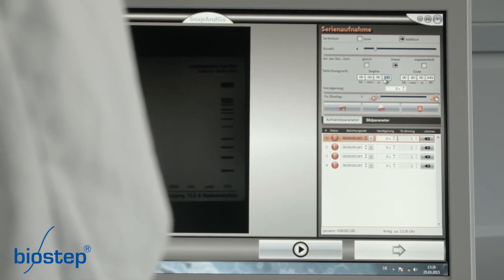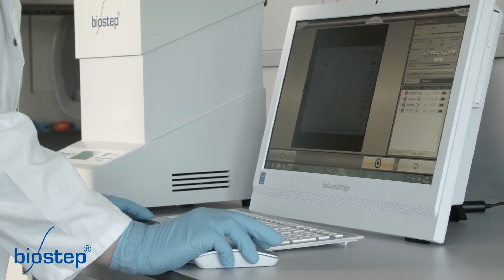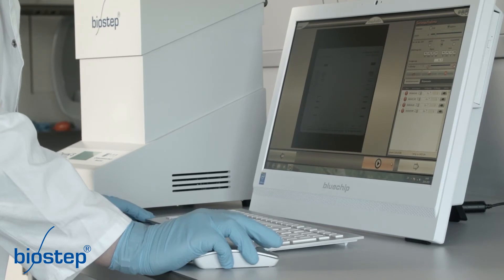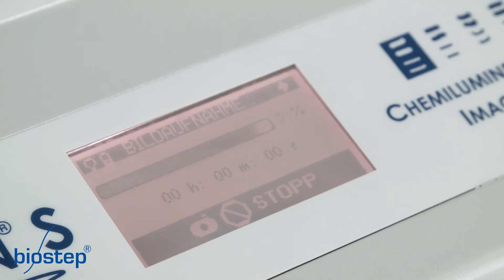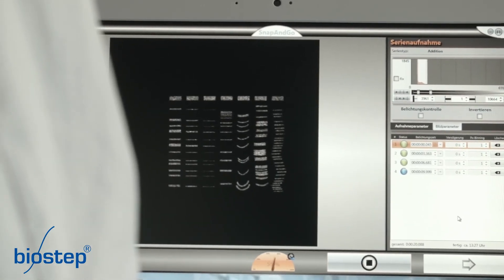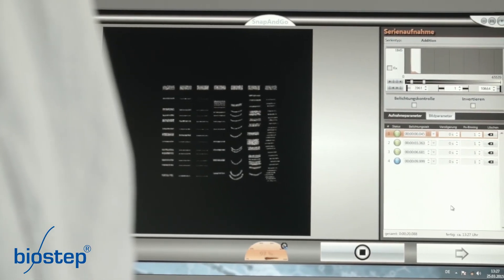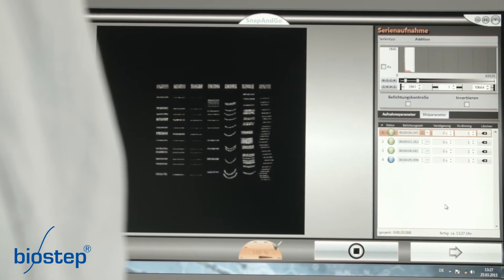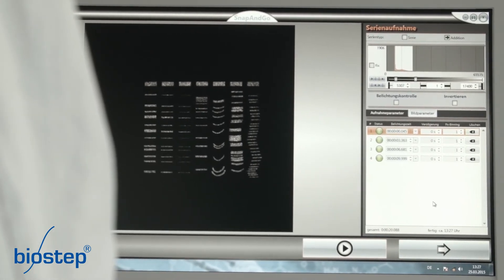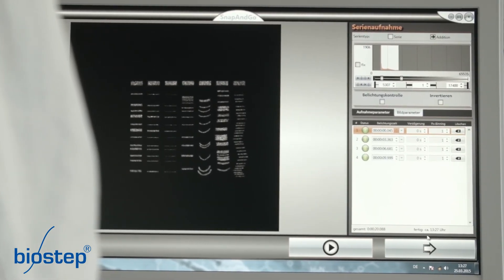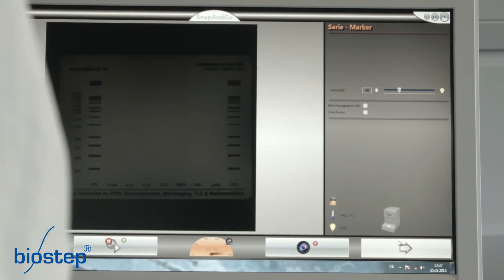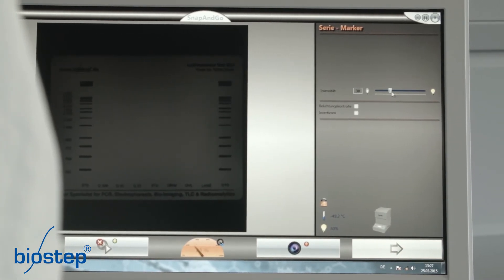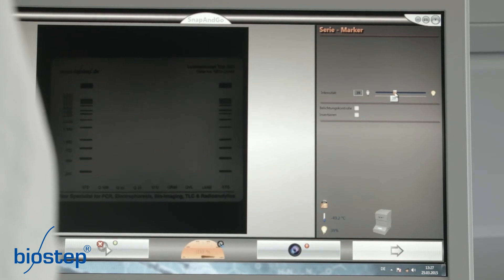Image capturing is started by clicking on Capture. The red color of the display indicates that the lid is locked. Images in process are marked in blue, finished images in green and remaining images are marked in red. After capturing is finished, you can hear an acoustic signal.